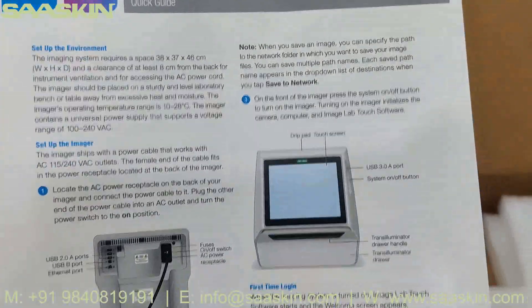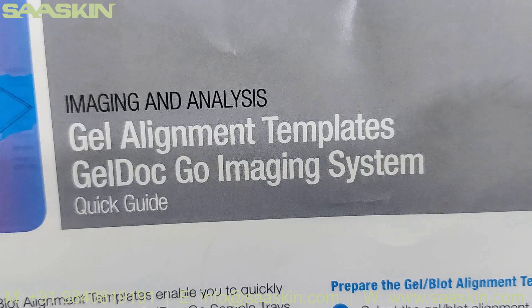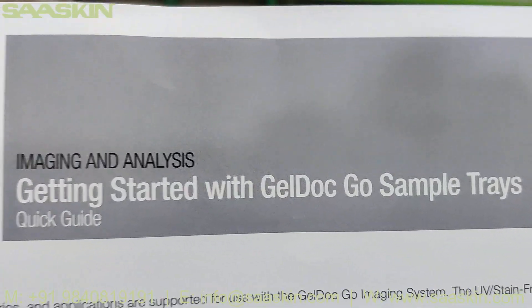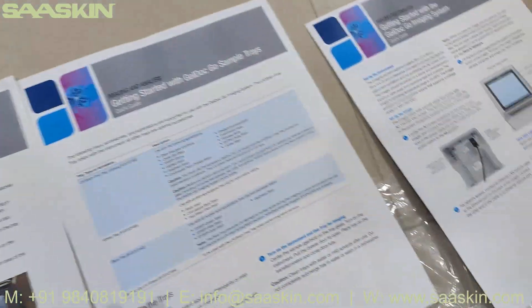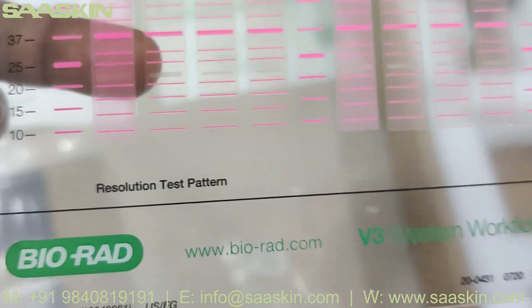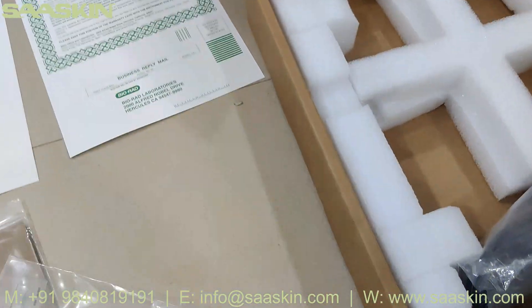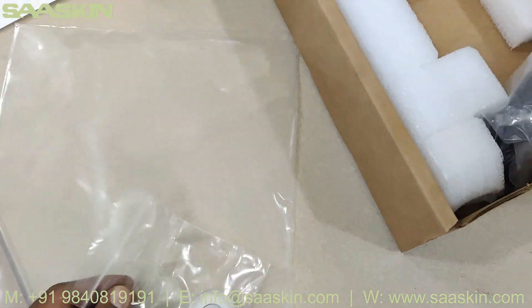You have a quick guide for getting started with the GelDoc Go imaging system. And then you have another quick guide — gel alignment templates. Then you get a quick guide for imaging analysis: getting started with GelDoc Go sample trace. So you have actually three guides here. You also get stickers and a resolution test pattern — you got a pattern here to compare.